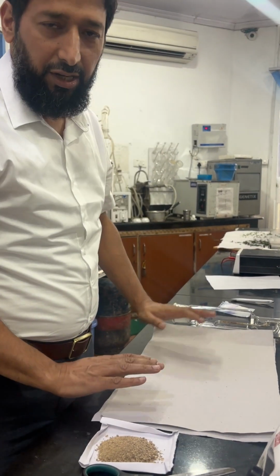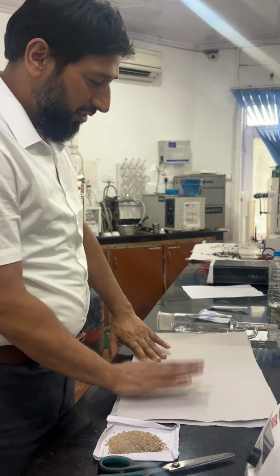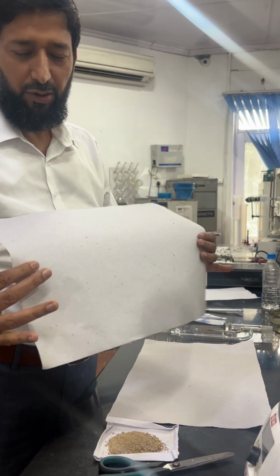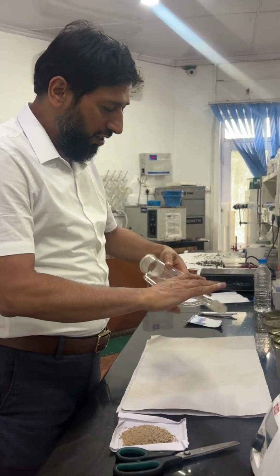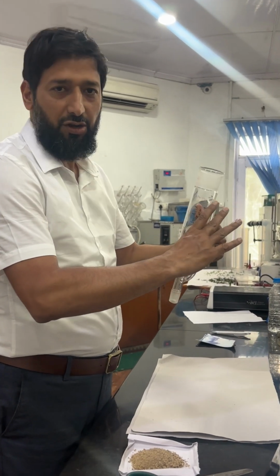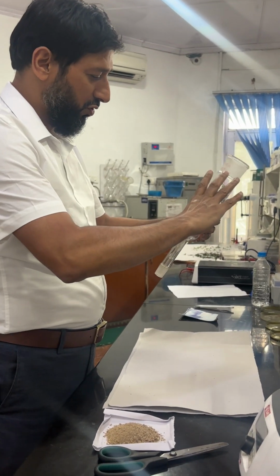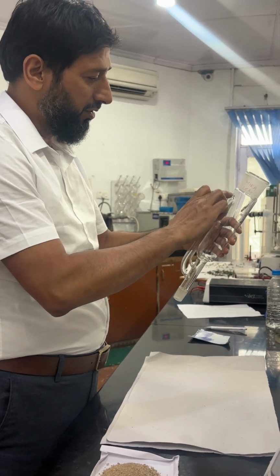So today we'll be showing you how to make a thimble and how to run a Soxhlet. You have to have a blotting paper, simple filter paper or blotting paper, and then you cut it so the thimble will fit in this, the upper portion of your Soxhlet. So you can focus on this. Our thimble should not be larger than this.